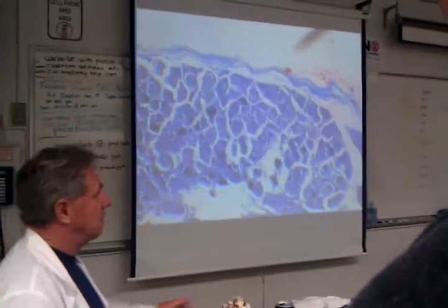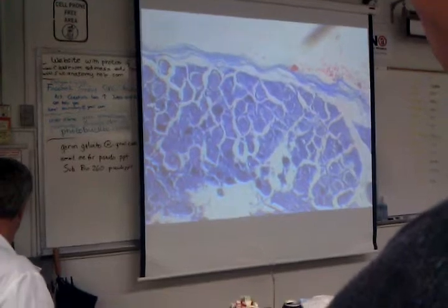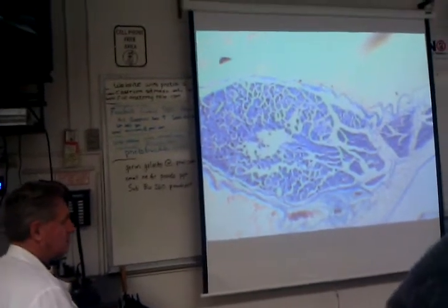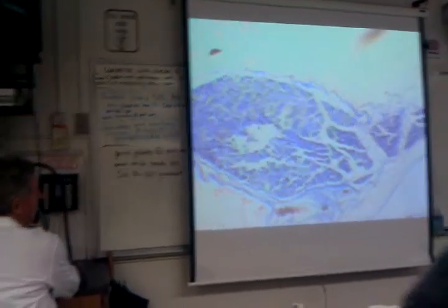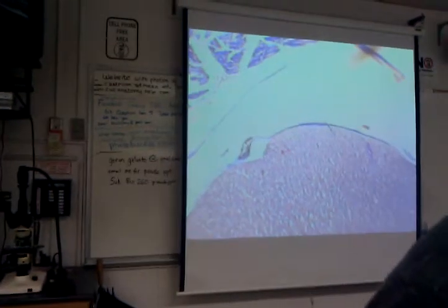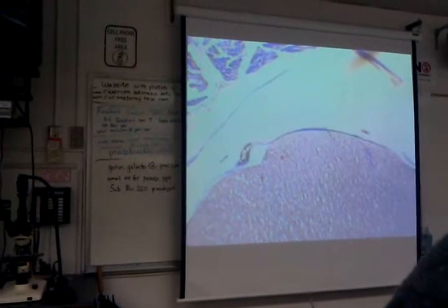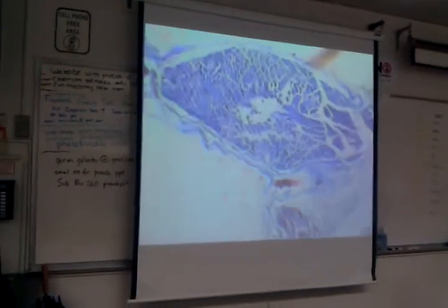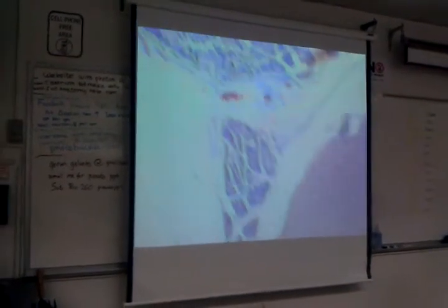Now, where this is located is right here. So look at this. This is the ganglia. Right here is the cord, which is the edge of the cord. So this is the central nervous system. This is the peripheral nervous system. So this thing here, the dorsal root ganglia, the sensory neuron cell bodies, is in the peripheral nervous system because it isn't in here. Right? So this is what happens.